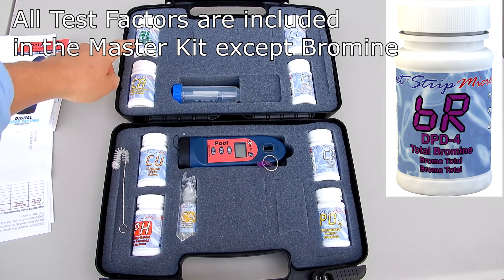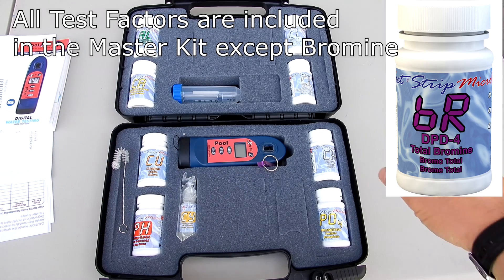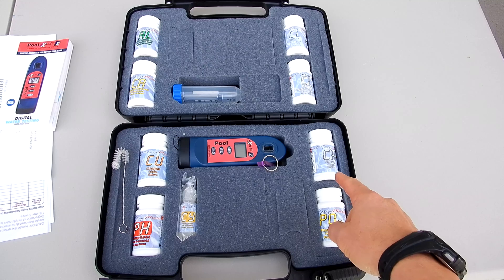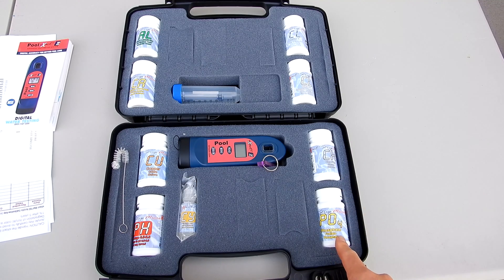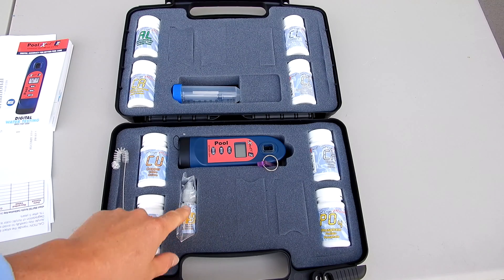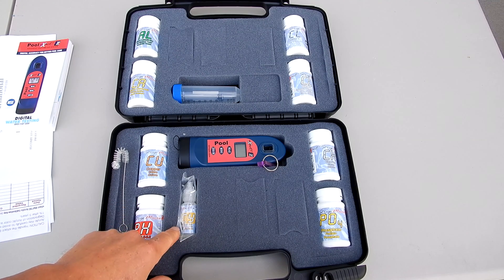Included in the KM are these test factors: alkalinity, calcium hardness, free chlorine, combined chlorine, chloride or salt, phosphate, pH, and copper. Also included is the liquid reagent for the cyanuric acid test.